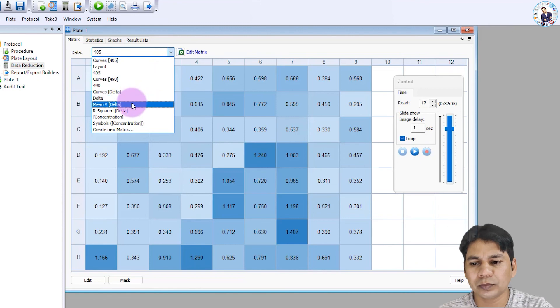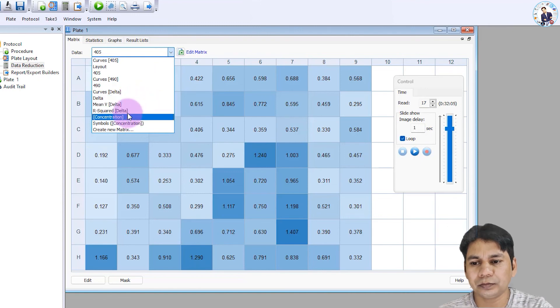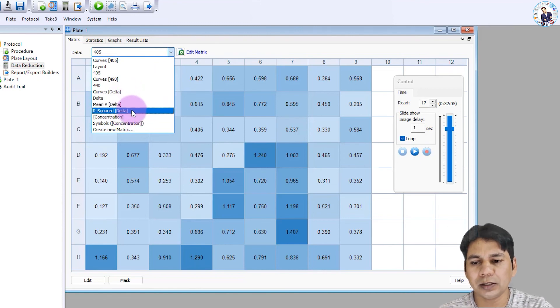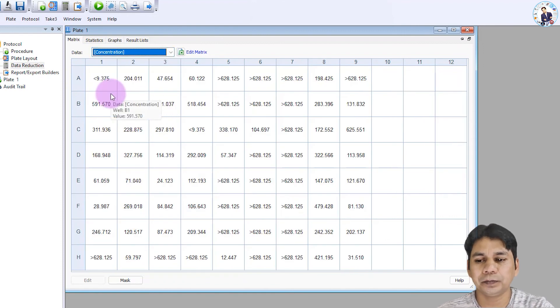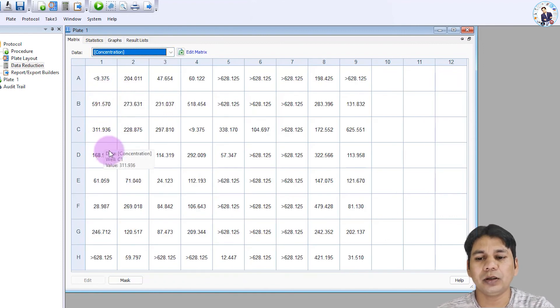If you select the concentration view, you can see the concentration in picograms for each well.